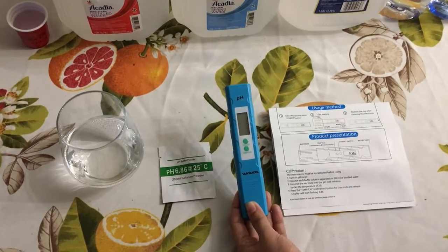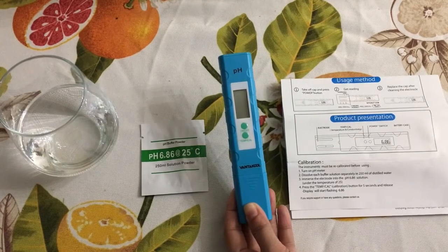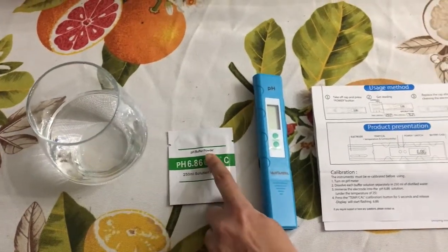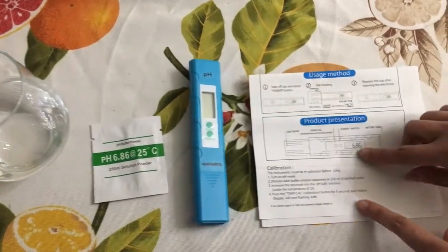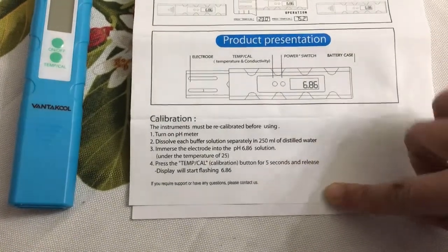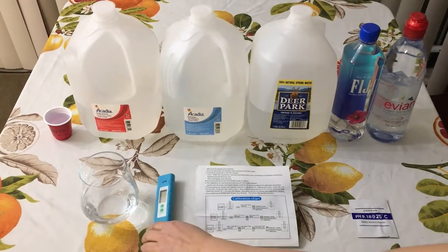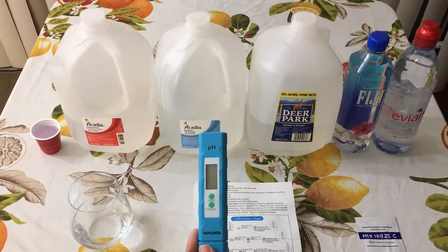Since this is a new unit, we need to calibrate it before performing the pH test on water. For that we need distilled water and pH buffer powder, which comes with this unit, and we are going to follow the calibration steps provided in the user manual. I have calibrated my device for two solutions: 6.86 and 4.01.